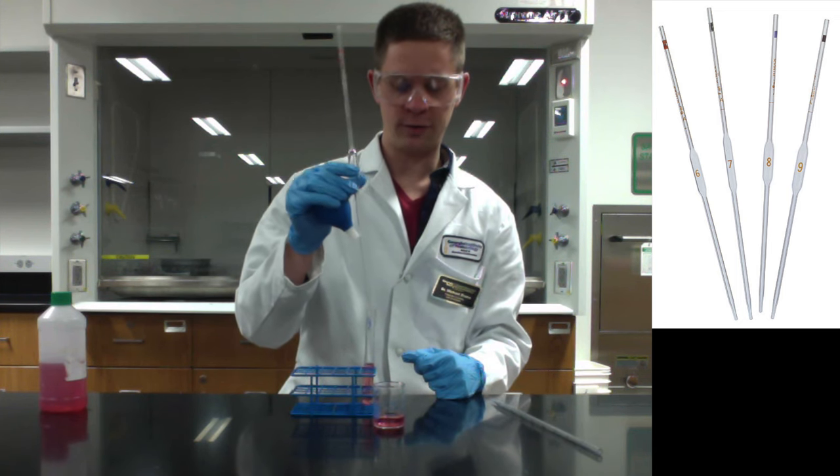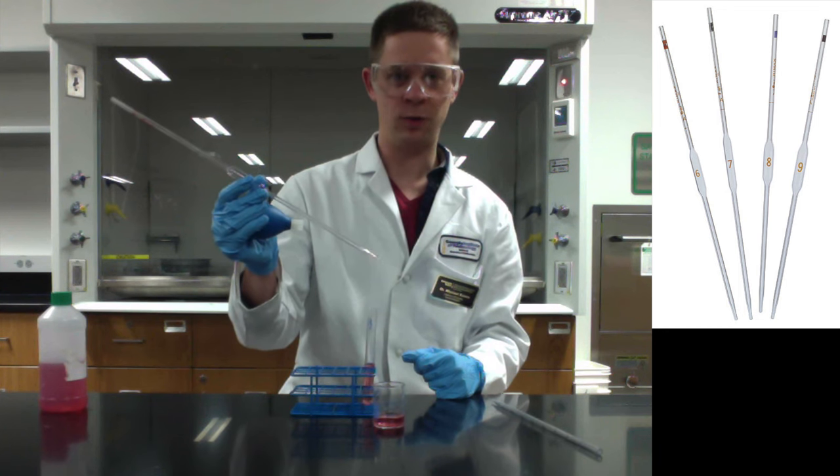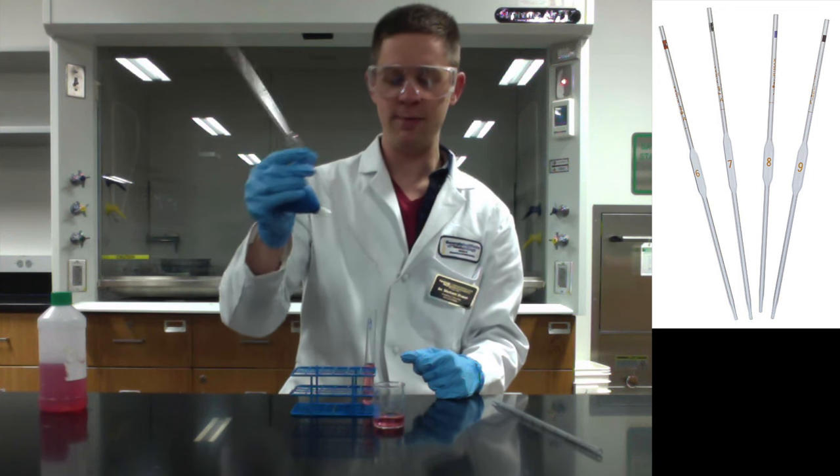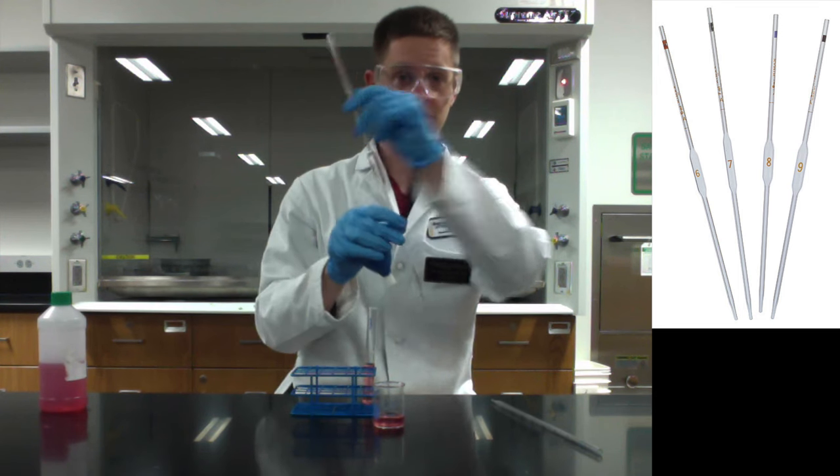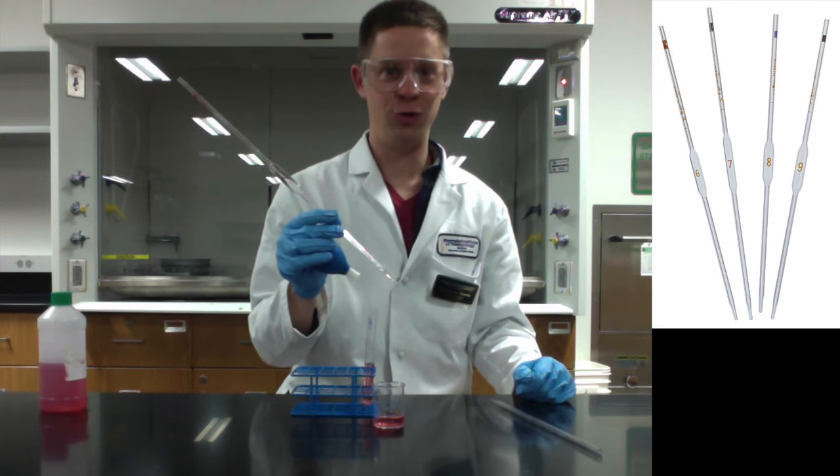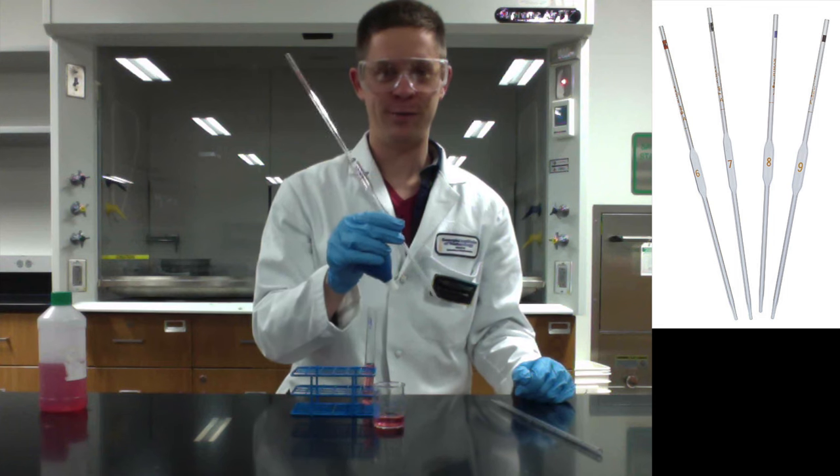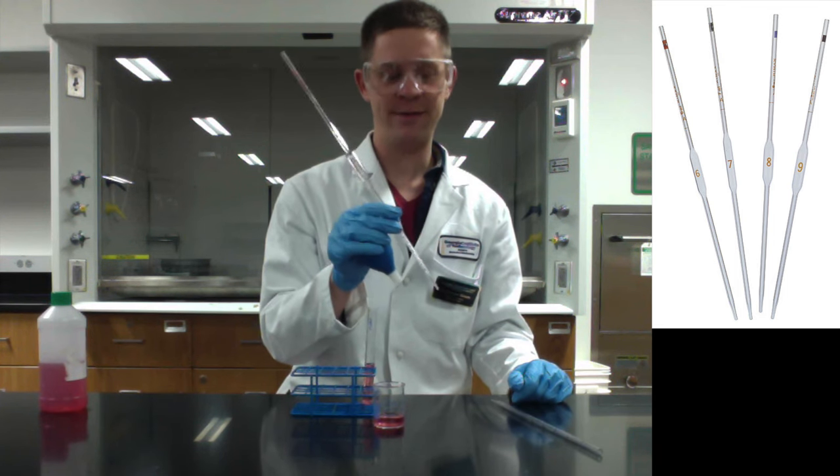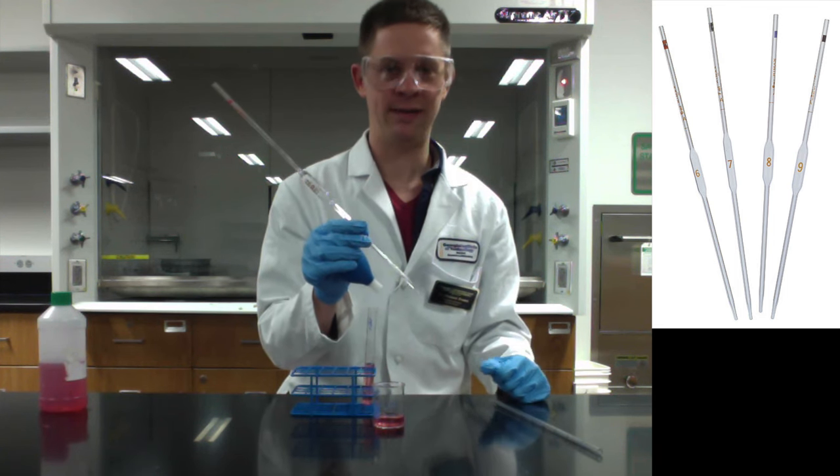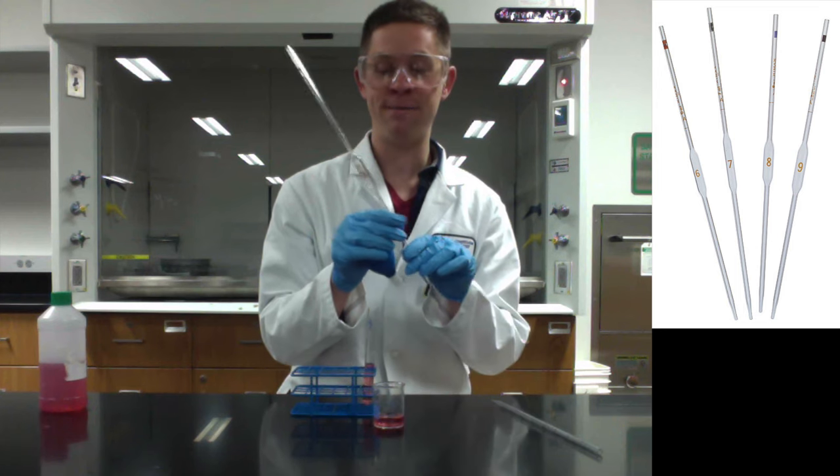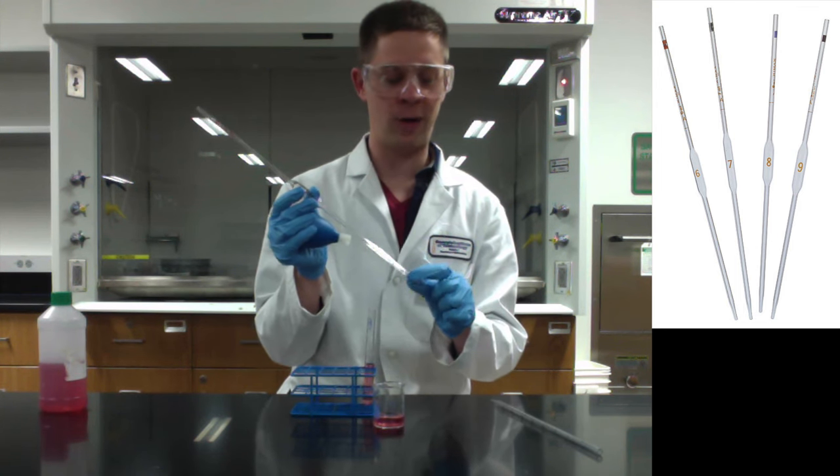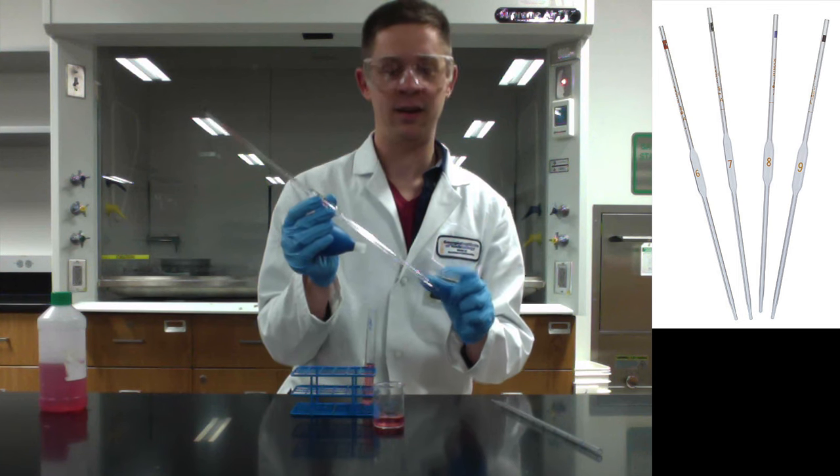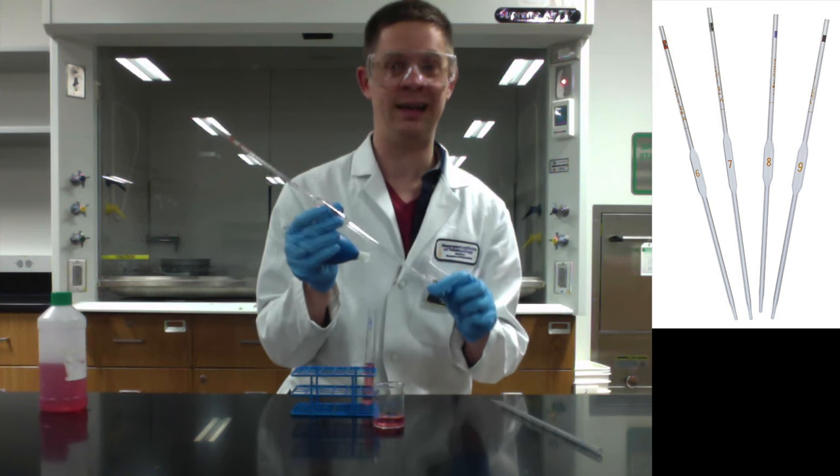So the question arises what to do with this amount of liquid left in the pipette. And you may be tempted to use the bulb to blow out the rest of that liquid. Don't do that. Again, these volumetric pipettes are precision crafted so that that little bit of liquid left in the bottom of the pipette is not factored in to this 10 milliliter figure. In other words, do not blow out the bottom of this.